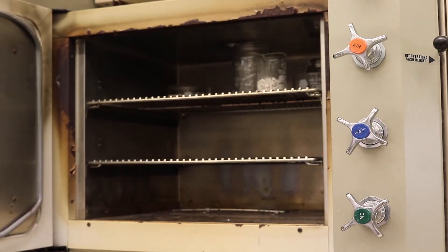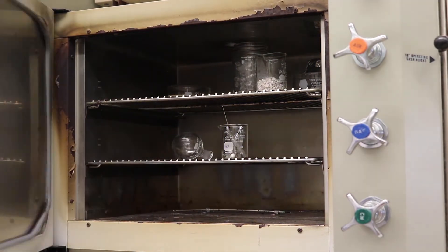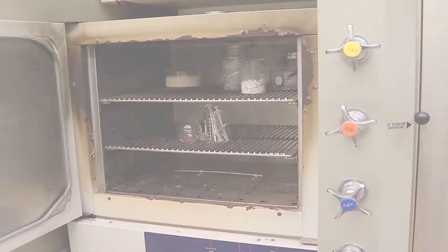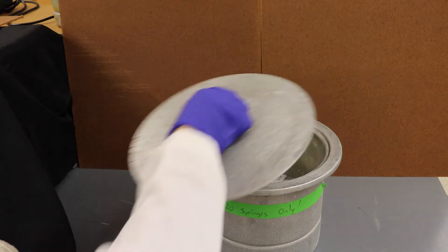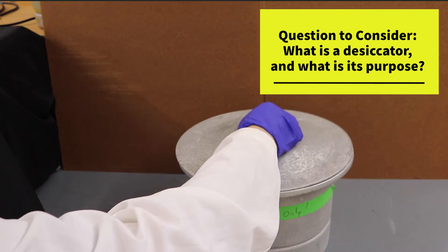Next, place the washed equipment into the oven for at least 5 minutes to let them dry. Be sure to use heat resistant gloves when removing the hot glassware from the oven. Place the equipment into the desiccator for 10 minutes. The desiccator is a dry environment used to cool down the glassware and needles without reintroducing moisture from the air back into the equipment.